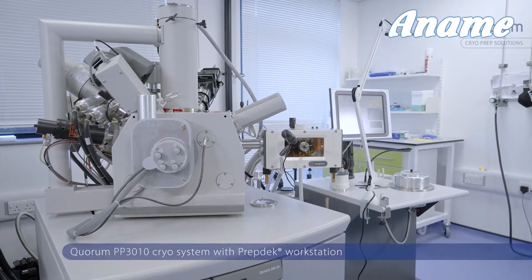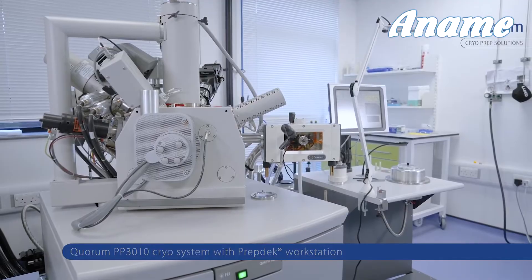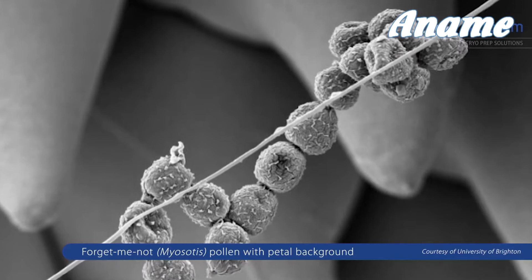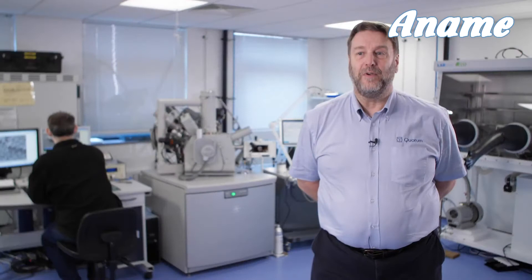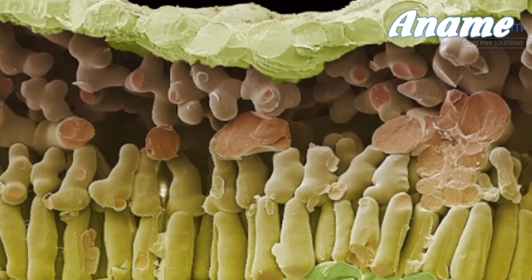Cryo-SEM is the technique that allows users to image wet or beam-sensitive samples in as close to their lifelike state as possible. It eliminates a lot of the effects you get when using chemical fixation or cryo-CPD. It allows you to image delicate structures which are often stripped off by chemical processes. You can do time-lapse imaging by regular periods of freezing and imaging your sample, fracture the sample to reveal internal structure, and if you're looking at things like lithium battery components which are very beam-sensitive, you can eliminate a lot of the beam damage.